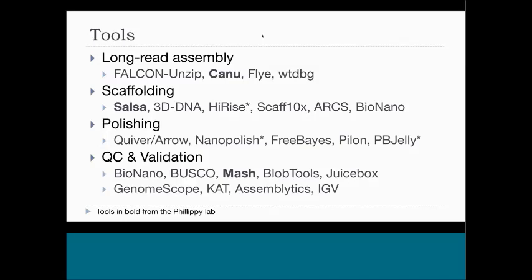So if you simply take the PacBio reads or the nanopore reads or the optical reads and map them to your assembly, areas of low mapping quality and low depth of coverage are almost universally areas of the assembly that will be of low quality or might even be structurally incorrect.